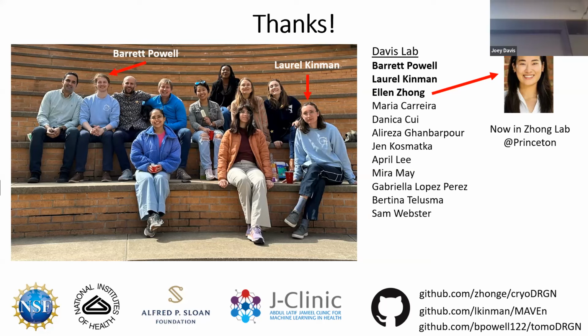Yeah, I think this gets back to the question of how small of a signal change you can detect. If you had subtle changes in conformers, let's say 2 different conformers that could bind, could you sort on that signal? So I've restated your question, but haven't given you an answer. We haven't been able to do that.